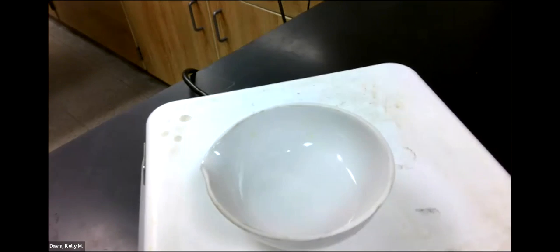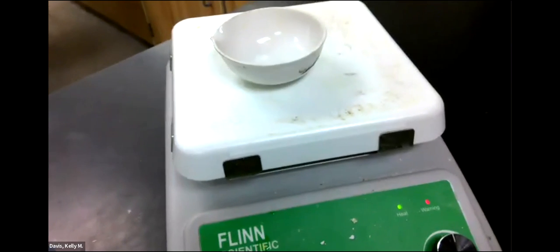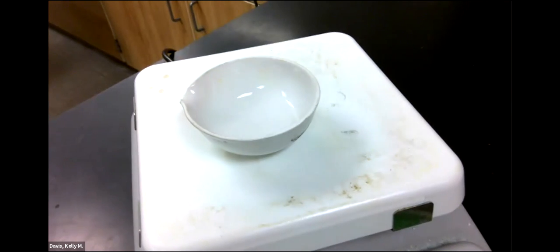So I'll just leave that there for a second, so at least we can see it getting started, boiling and evaporating away. So I'll turn it up a little bit. I don't want it to be so hot that it might crack.